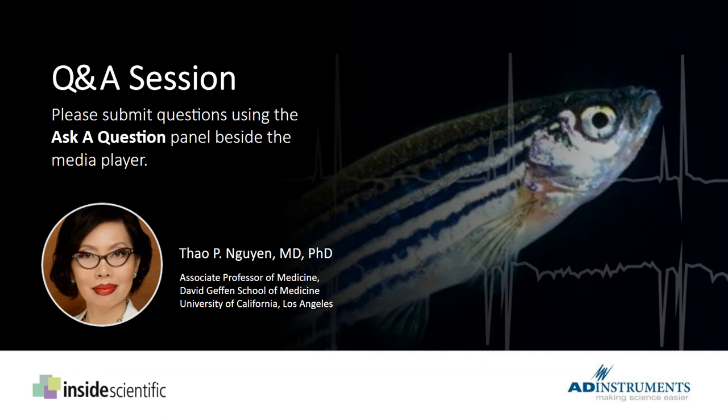If you think about cardiac action potential, there are basically 3 types of currents that are important: the sodium currents, the potassium currents, and the calcium currents. We suspect some potassium currents are responsible for setting up the difference in axis, at least in ventricular repolarization. Great question. Thank you, Sarah.